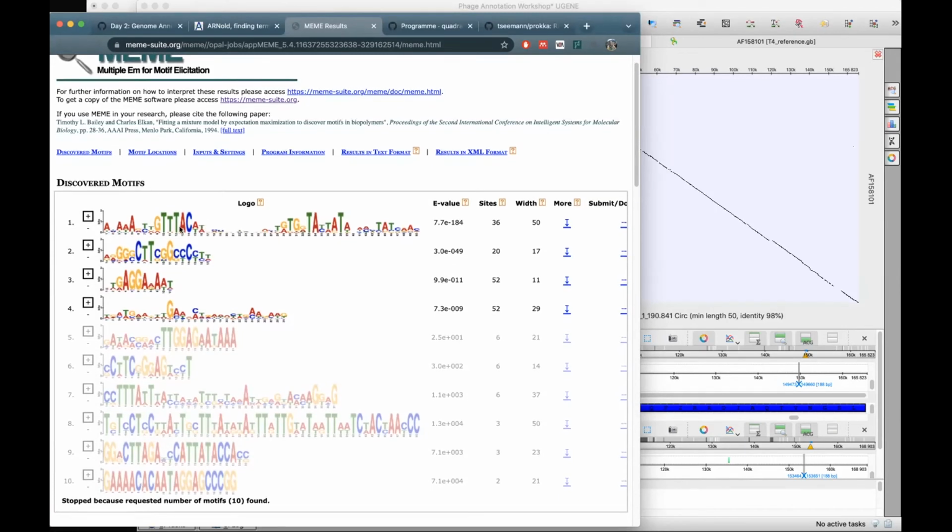And the first one that we find is actually the promoter that Andrew used as an example, because it has the GTTTAC minus 35 box and the TATTAT minus 10 box. Because we've clipped upstream, our start codon has fallen off.